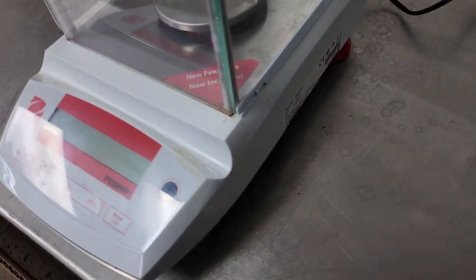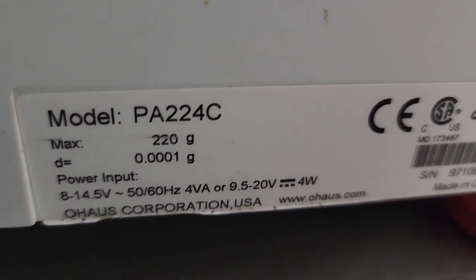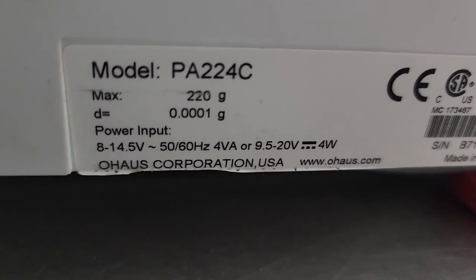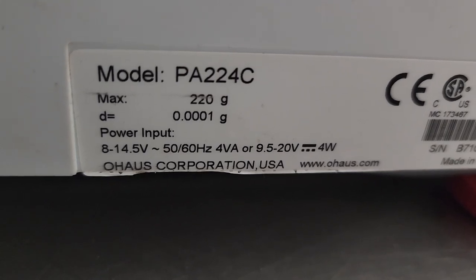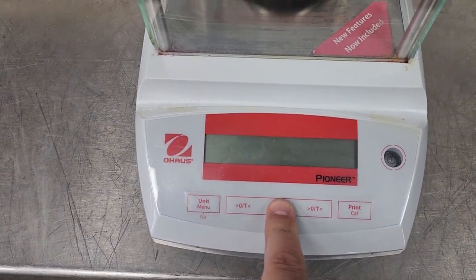This is an Ohaus Pioneer. It is a PA224C. It'll go from, looks like, what is that? 10 thousandth of a gram. Anyways, let's power this up.